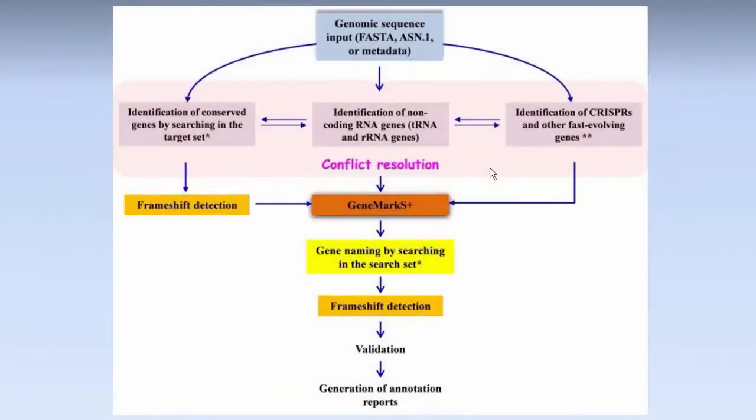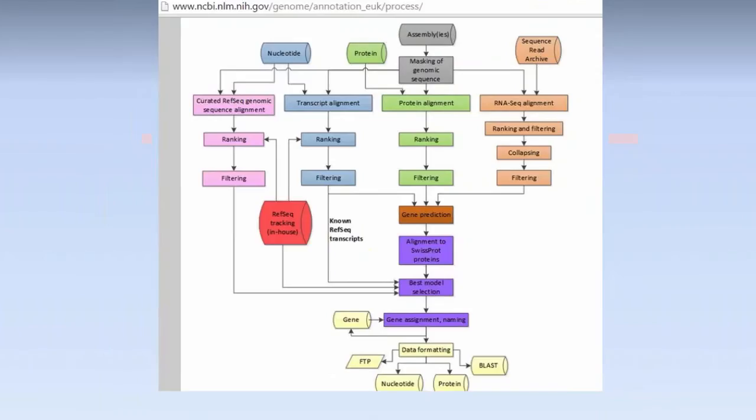I wanted to talk a little bit about our genome annotation pipelines. These are user questions I get quite a bit. And if you have other questions about our annotation pipelines, please email us at webinars at ncbi.nlm.nih.gov. This is our prokaryotic annotation pipeline. If you submit us bacterial genomes as contigs, scaffolds, or preferably as whole chromosomes, we will annotate your bacteria for you. Also, we have a eukaryotic annotation pipeline.